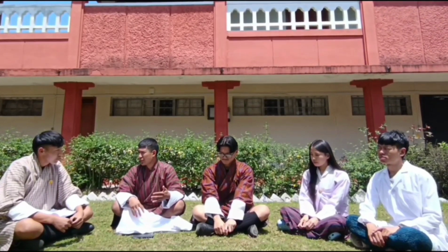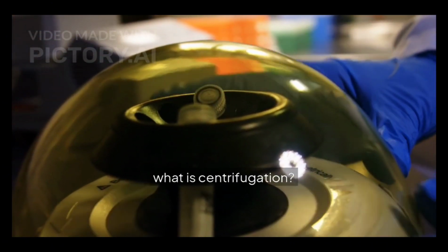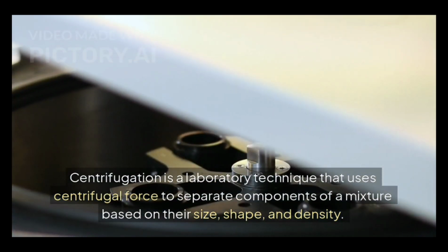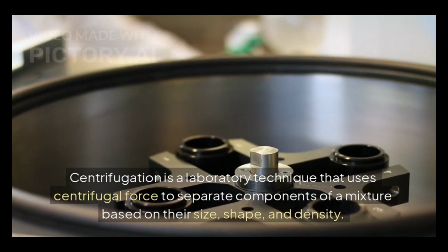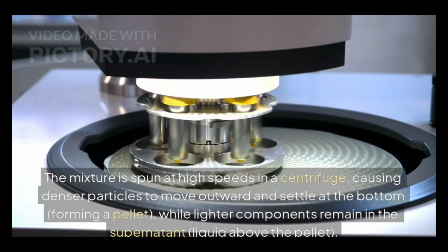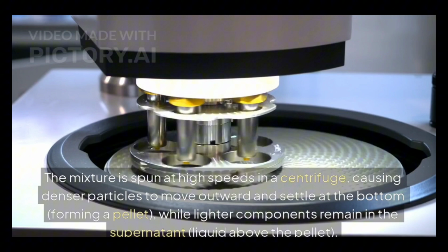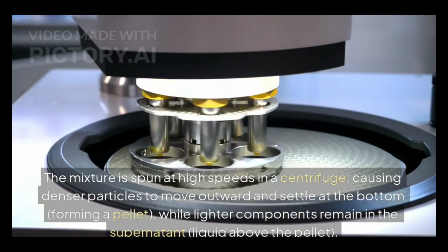Sure, it's about centrifugation and cell fractionation. What is centrifugation? Centrifugation is a laboratory technique that uses centrifugal force to separate components of a mixture based on their size, shape, and density. The mixture is spun at high speed in a centrifuge, causing denser particles to move outward and settle at the bottom, forming a pellet, while lighter components remain in the supernatant liquid above the pellet.